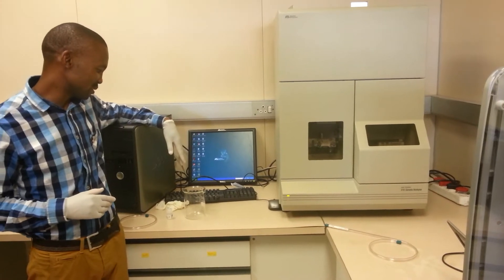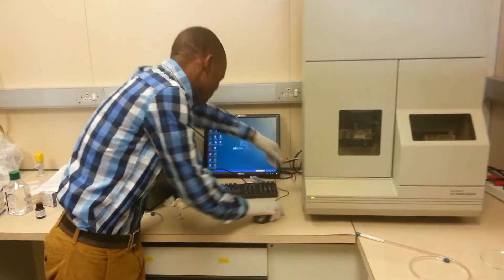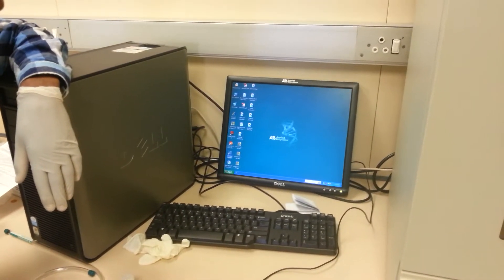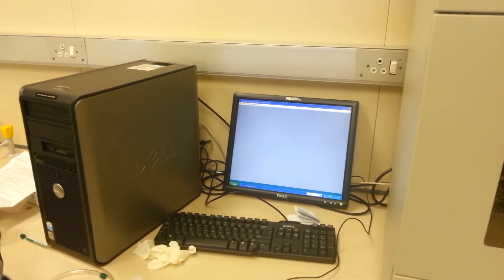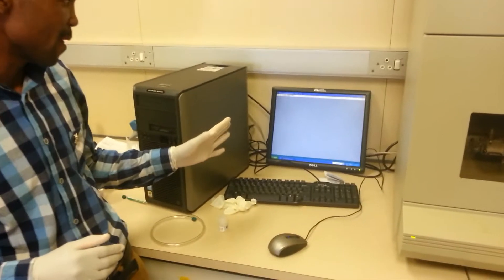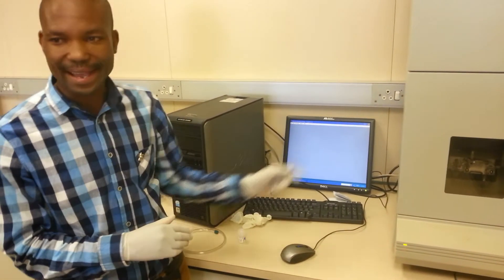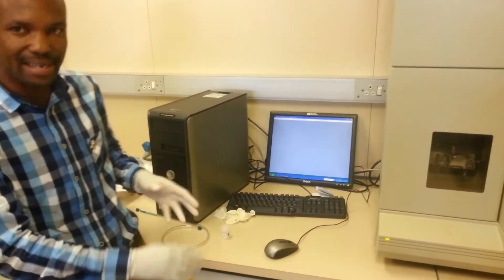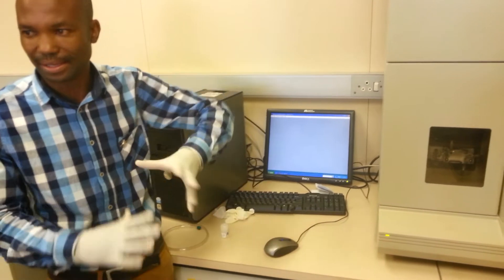After the instrument is on, this is the software — the data collection software. This is the icon. Just double-click on there and this will open. So this is the data collection software. If there was no communication between the PC and the instrument, you would have gotten an error message. If somebody moved the PC and unplugged the COM cable, before you even get to the screen, you get an error message to say there's no communication.